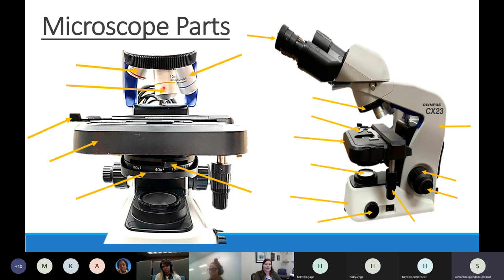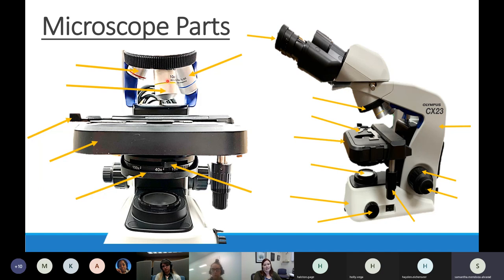Next to the red scanning objective is the yellow objective, called the low power objective, which magnifies things 10 times - similar to the oculars. The yellow is kind of my medium objective. When we need things to be really big - like when we're doing tissues in a couple of weeks - we'll use the blue objective, called the high power objective, which by itself makes things 40 times bigger. So: scanning/red = 4x, low power/yellow = 10x, high power/blue = 40x.